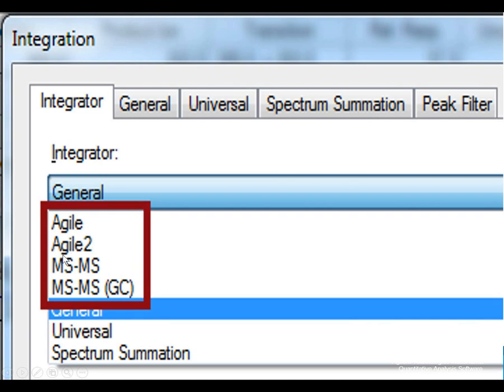local baseline smart approach. Now a word here, I've seen folks that have actually mixed up parameterless integrators with parameter integrators. It's difficult to beat a parameter approach if you know what's coming with the signal. So there are cases where the general and universal come in very handy to handle compounds which aren't well resolved.